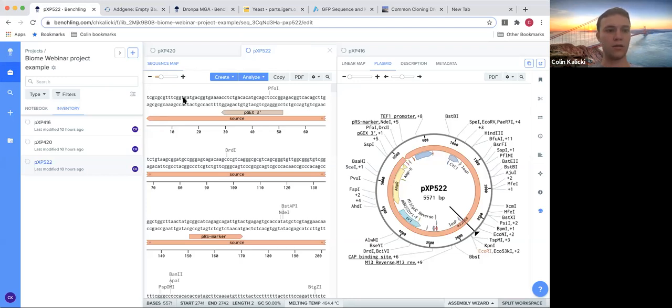I implore you to explore as much as you can with this, and more than I have even, to really get a good grasp of this, because it's going to help you learn a lot of techniques in biology, but also feel what it's like to actually be working in a wet lab. Because before you do any wet lab work, you're probably going to be doing some designing to make sure your experiments go well. And so you're going to use Benchling for that.